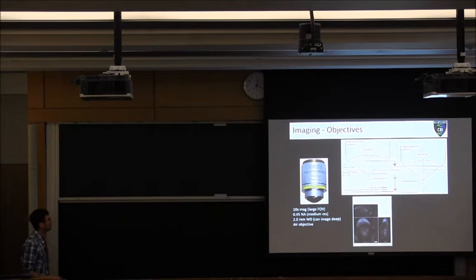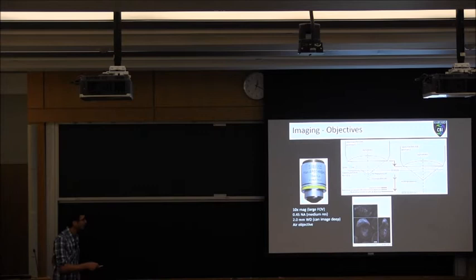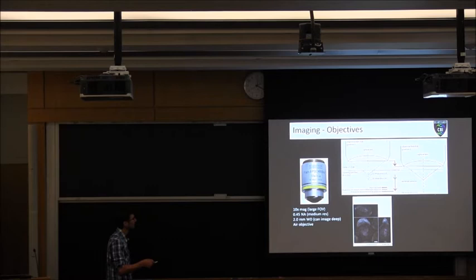If you do a Z-stack through that sample, this is just a spheroid, which we should know should be quite spherical. It's called a spheroid. But it actually looks pretty flat here. This is the XZ projection and the YZ projection, and this is just an XY plane. And you can see it looks kind of squished, it's not round at all. It's like an oval. And that's because the microscope only thinks it's moved this far, and it's taken this much data and squished it flat into this distance.